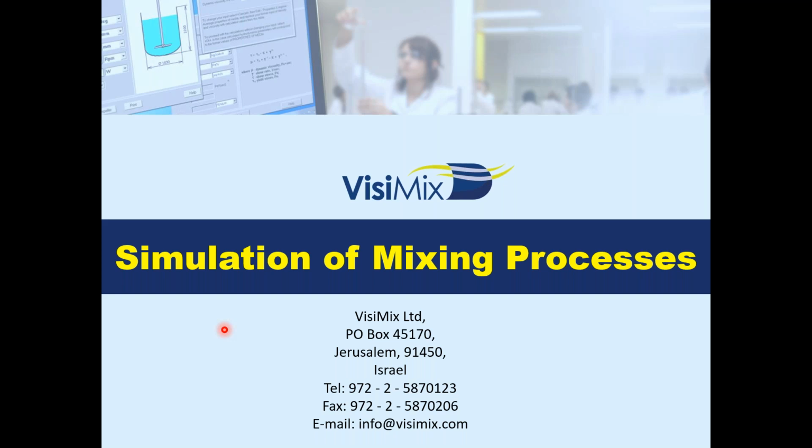In this case, we'll talk about multiple reactions that always happen together in a tank. Of course, we have main reactions and secondary reactions, but we will be able to apply any one of them and understand what will be the influence of the hydrodynamics we are providing to our process to generate results.